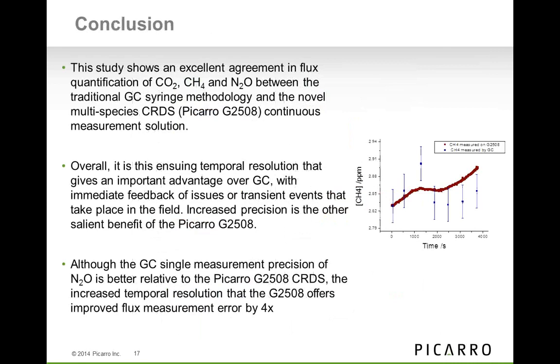So as a conclusion, we've shown that both instruments show the same story of N2O, methane, and CO2 fluxes, with it ultimately boiling down to the temporal resolution that the G2508 gives us. And in addition, it gives us this great immediate feedback so we can see what's actually going on.